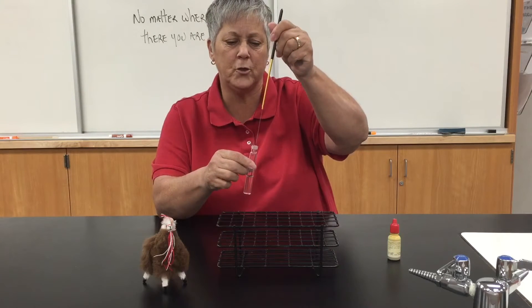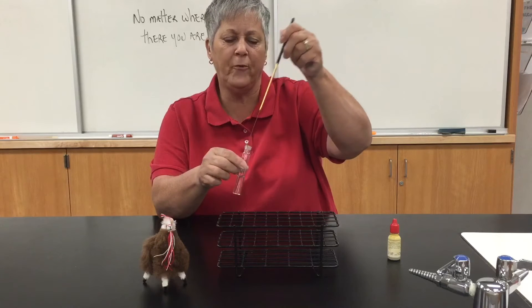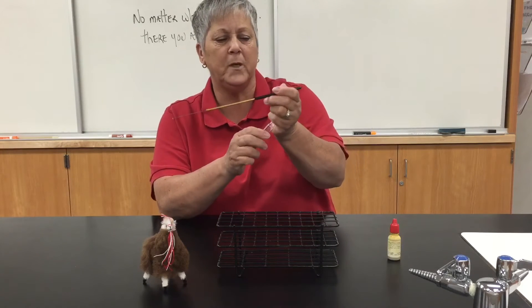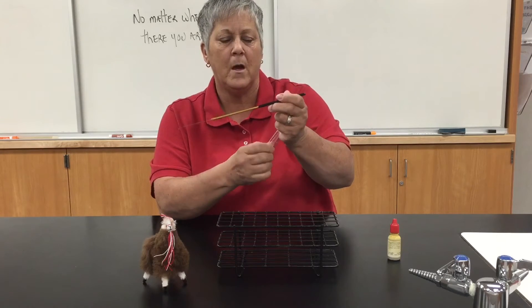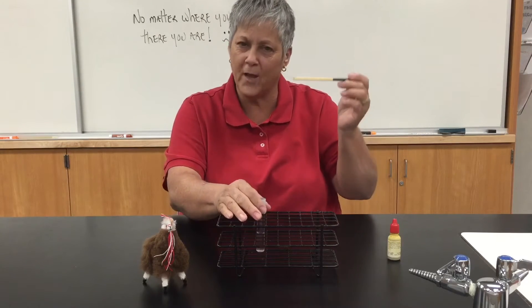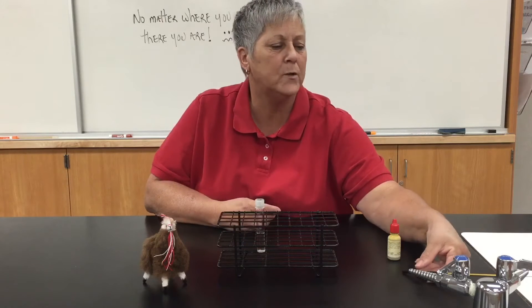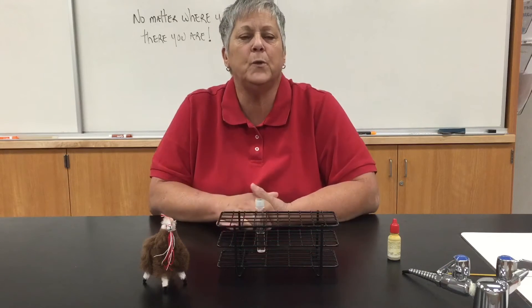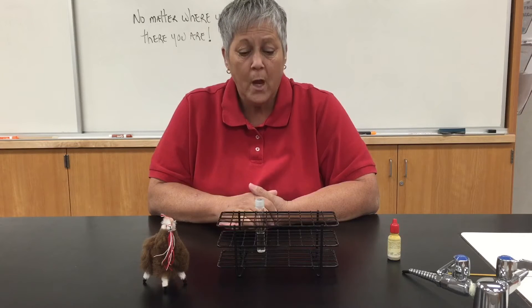I'd go into the tube, swish my loop full of organism in there, flame the lip of the tube again, replace the cap. Of course, I would flame my loop one last time, but I'm not using live bugs, so I'm not going to worry about it. These would incubate for the time specified in your lab manual.